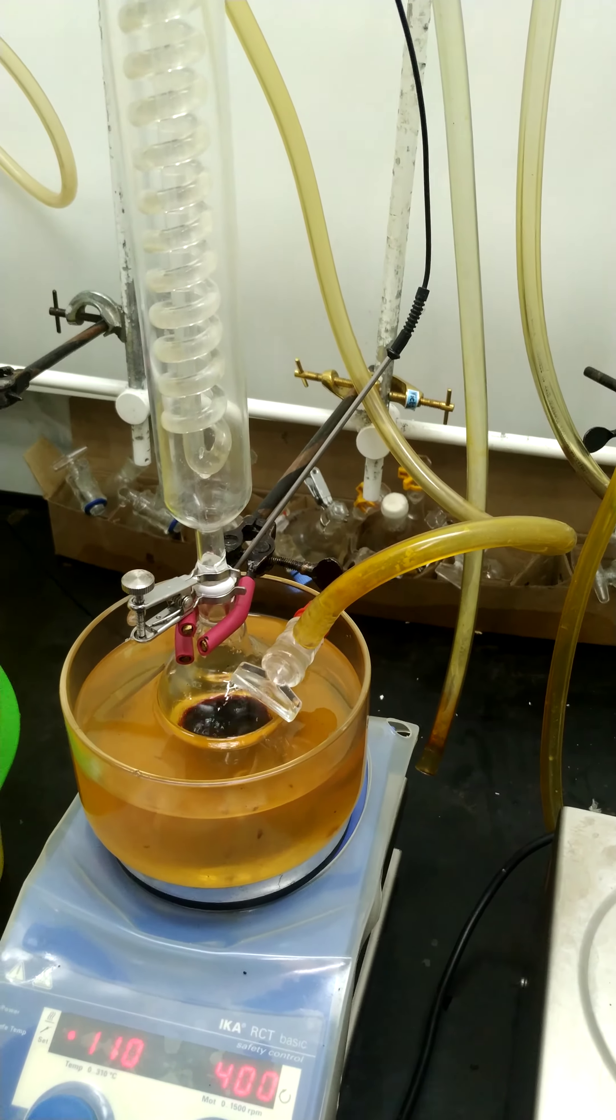You can see the schlenk line is at the back. The condenser is connected to the schlenk line through this pipe. You can always remove volatile components by applying vacuum. This is why reflux is an important technique we use for reactions.